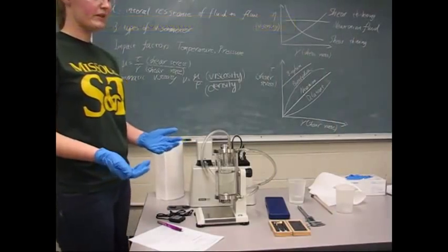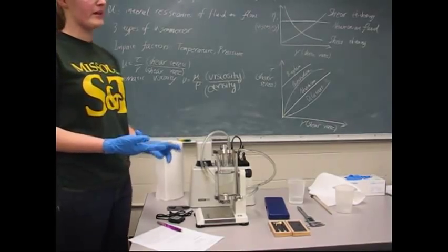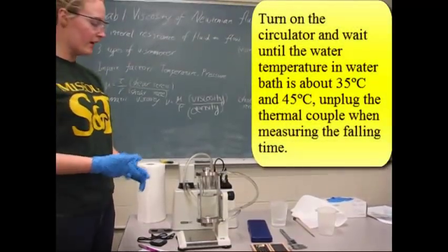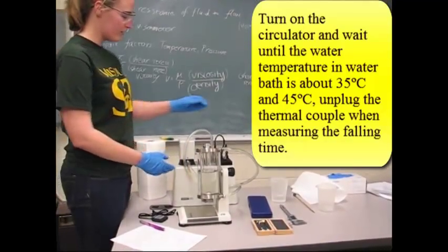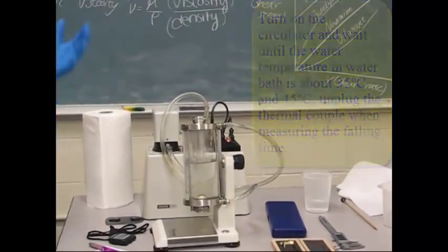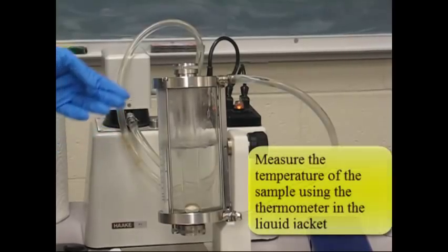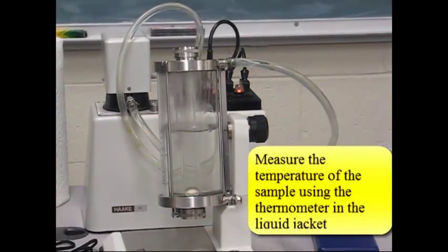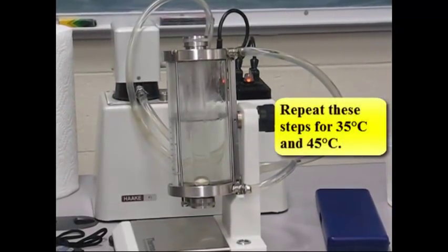So we just completed this experiment at room temperature and we're going to run the same experiment at two more temperatures at 35 degrees and 45 degrees. In order to heat the water jacket surrounding the tube to 35 degrees we use the circulator. We're going to turn on the circulator, let the water heat up and then use the thermometer inside the jacket to see when the water reaches 35 degrees and 45 degrees Celsius and then repeat the same steps that you saw before.